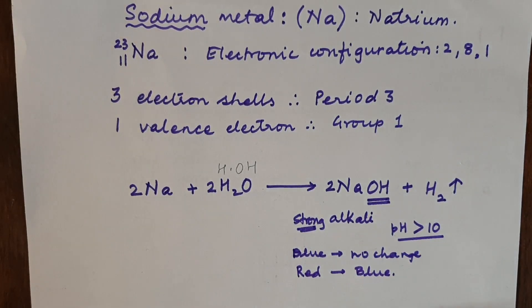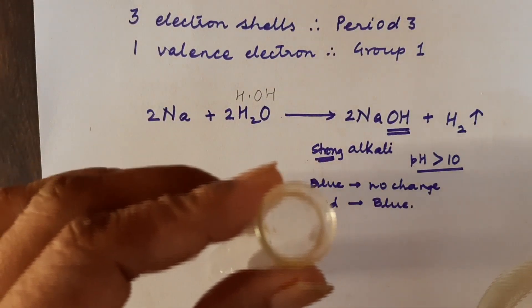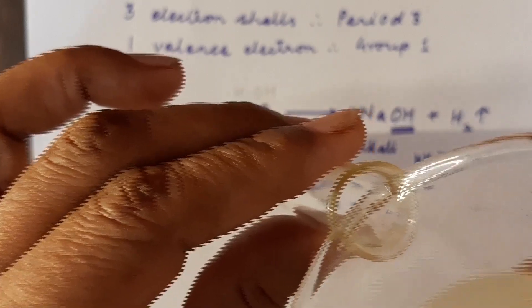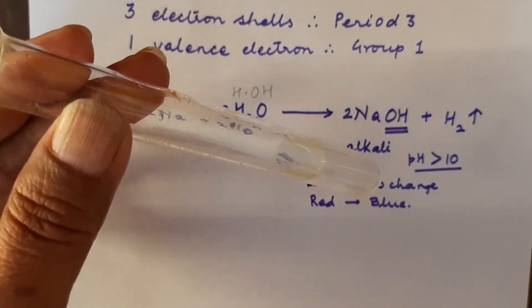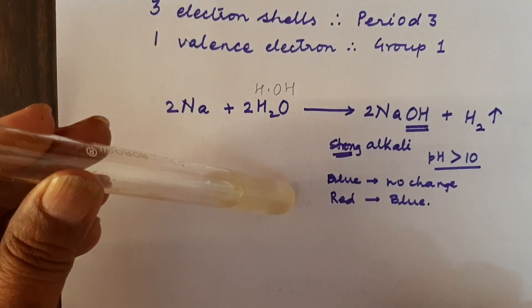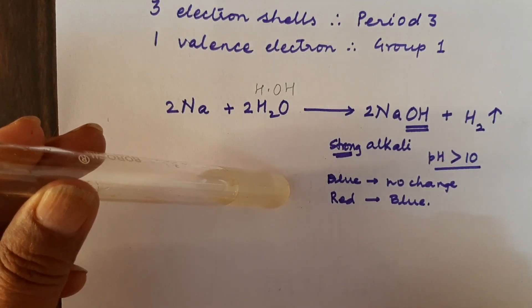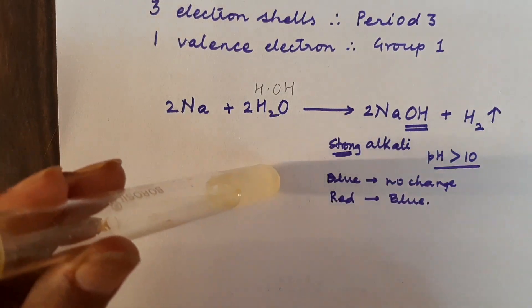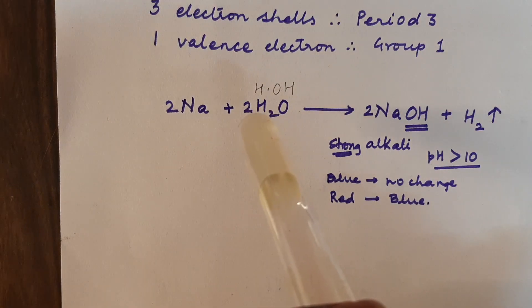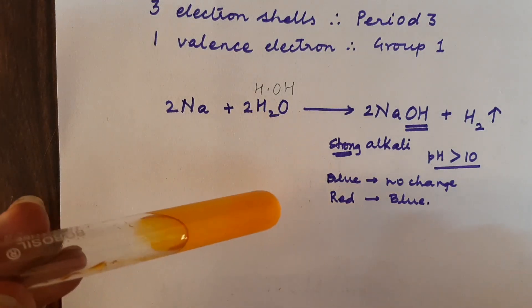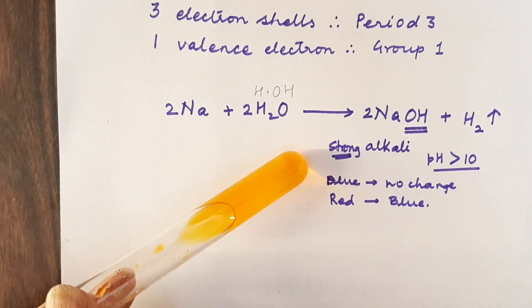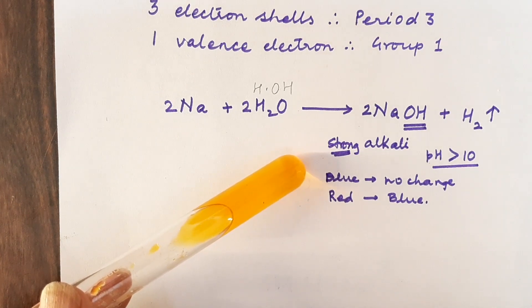We will also test with methyl orange and phenolphthalein. I am going to pour this solution into a small test tube so we can test it with methyl orange. Adding a drop of methyl orange — you can see that orange turns yellow, and that confirms this is an alkali.